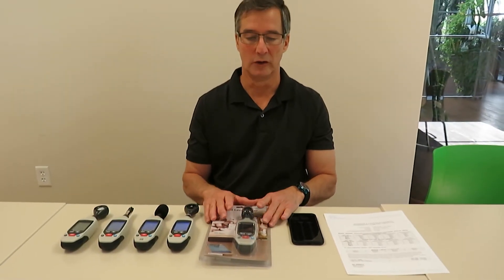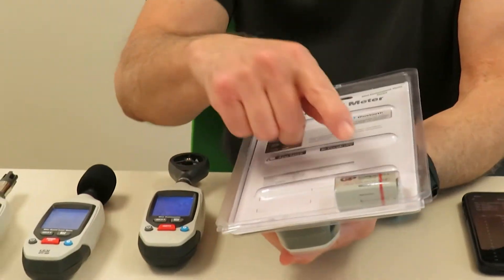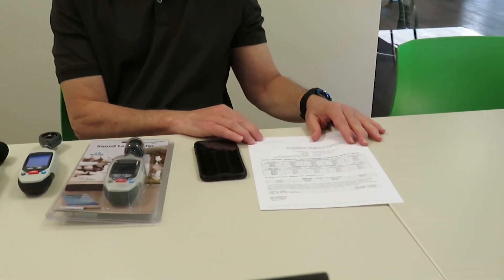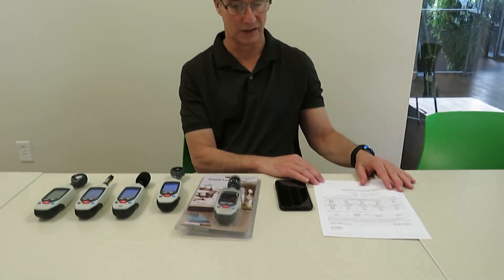They all come ready to use with a tripod screw in the back, a nine-volt battery, and full instructions. They're available with an optional certificate of calibration or certification to the National Institute of Standards and Technology.